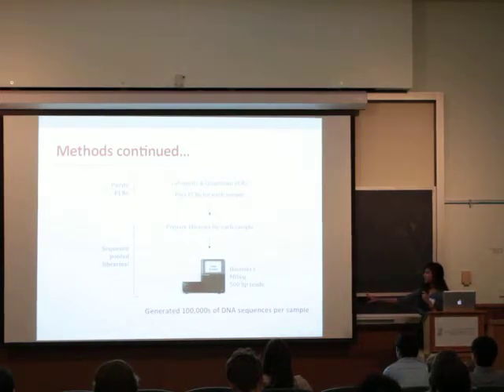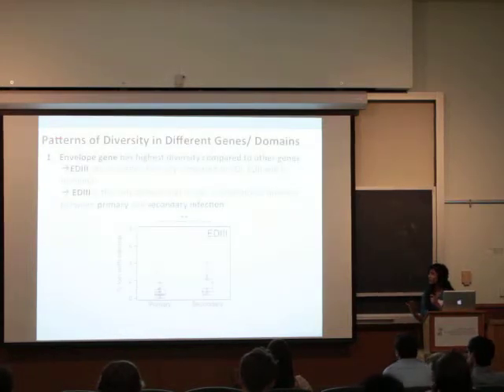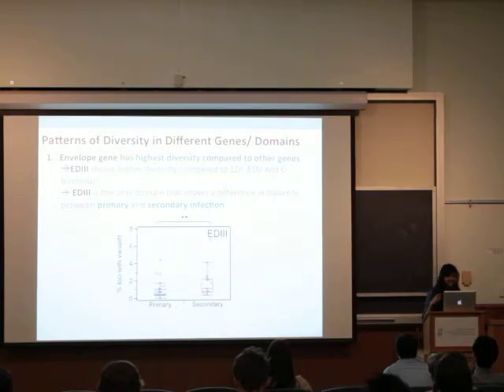And so the only way to be able to fully and properly analyze this huge data set is using bioinformatics. So my postdoc coded Python and Perl scripts to be able to do this analysis.